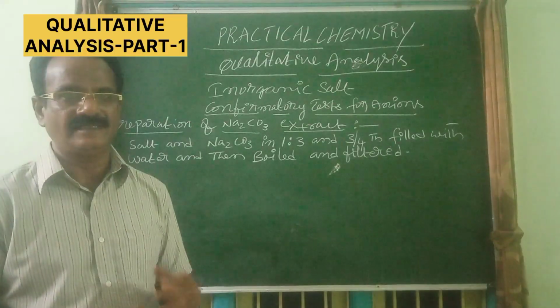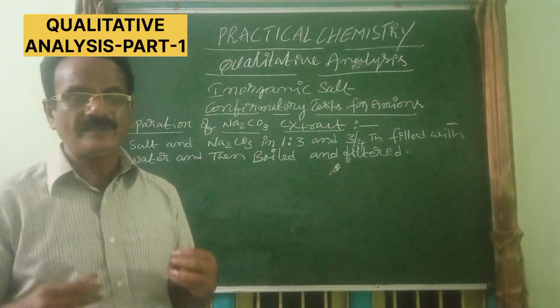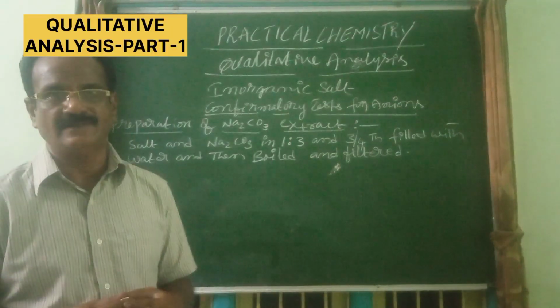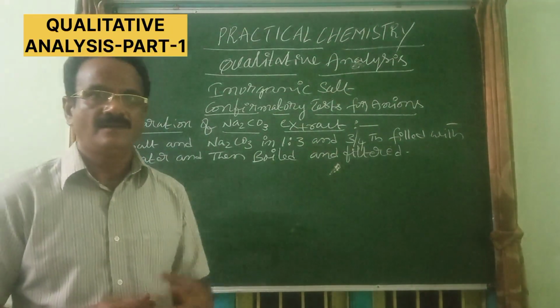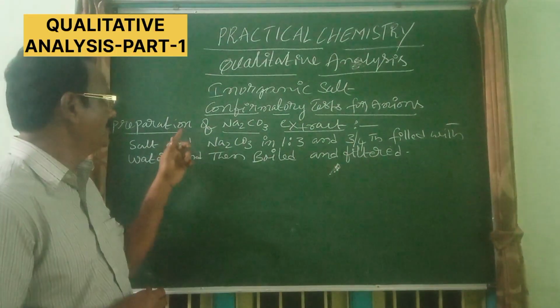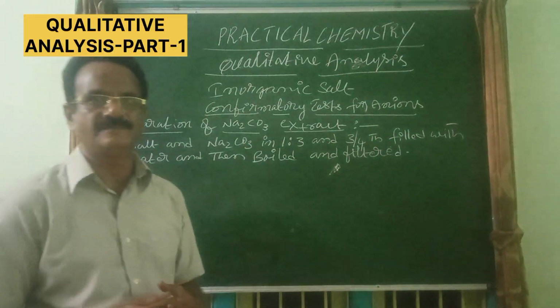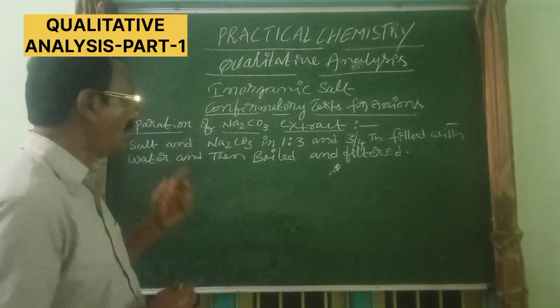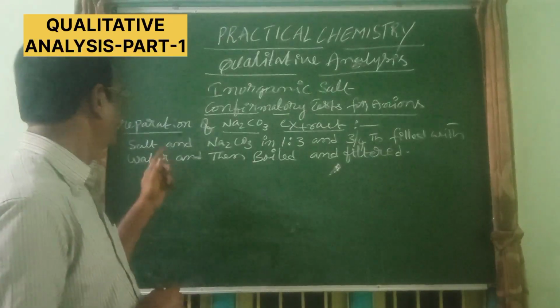Before doing confirmatory tests for identified anions, the analyst has to prepare sodium carbonate extract of given salt. So how is the extract to be prepared? Let us see.